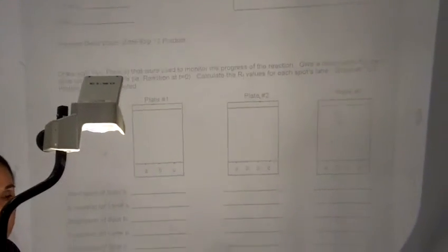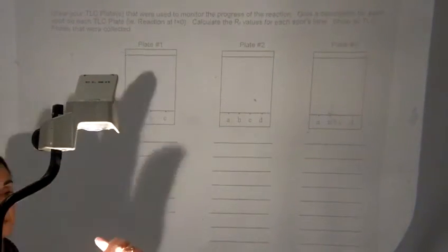You'll give your melting point range, your yield, percent yield, and draw the structure of your product. What does it look like? So don't forget this part, the physical description. And this is 12.5 and 12.6 of your lab manual.